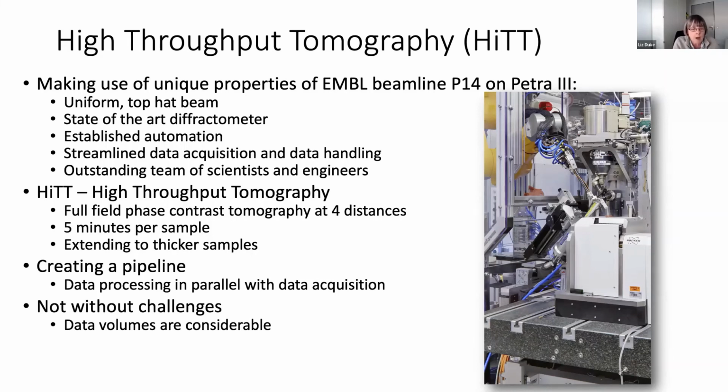And so here in Hamburg, we're developing what I'm calling HIT, which is high throughput tomography. It's phase contrast tomography. We collect data at 4 distances, and it takes us 5 minutes to mount a sample, collect all of those 4 data sets, and then dismount the sample. And then there is a pipeline developed for processing the data. And so very quickly, we can generate huge volumes of data, which in itself is an enormous challenge. But the opportunities are incredible.